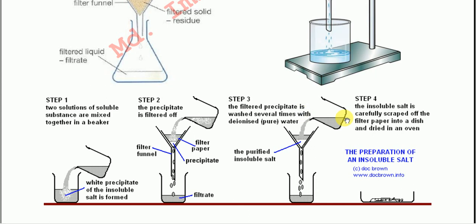After washing the aluminum hydroxide gel, you have to dry it, and this is the semi solid or dried aluminum hydroxide gel. After drying, you have to weigh the aluminum hydroxide gel and calculate the theoretical yield value. That's all about the preparation of aluminum hydroxide gel. Hope you have understood the theoretical part of this practical.